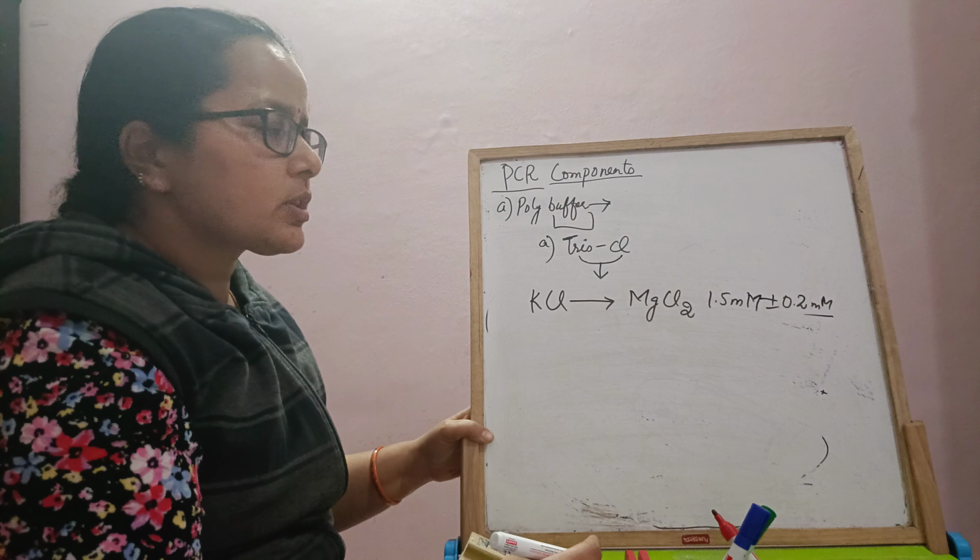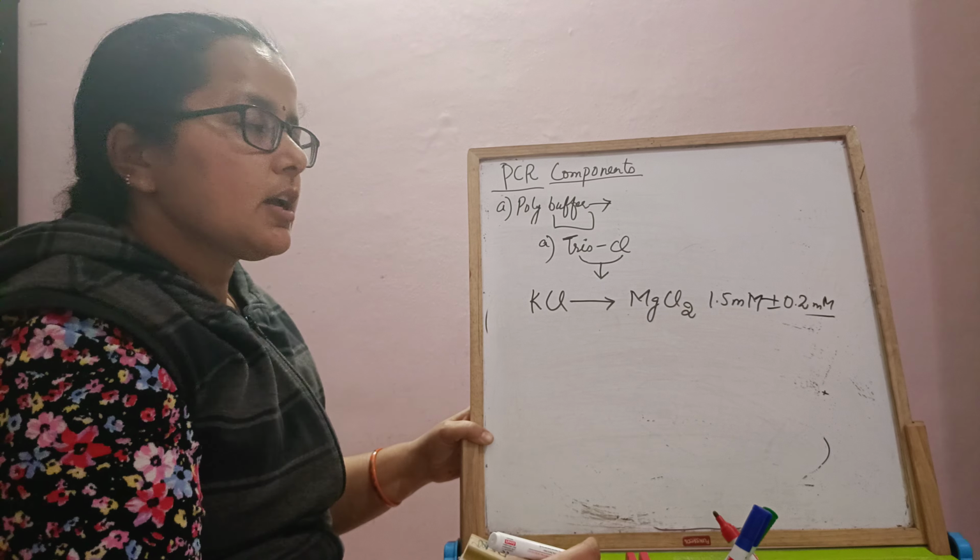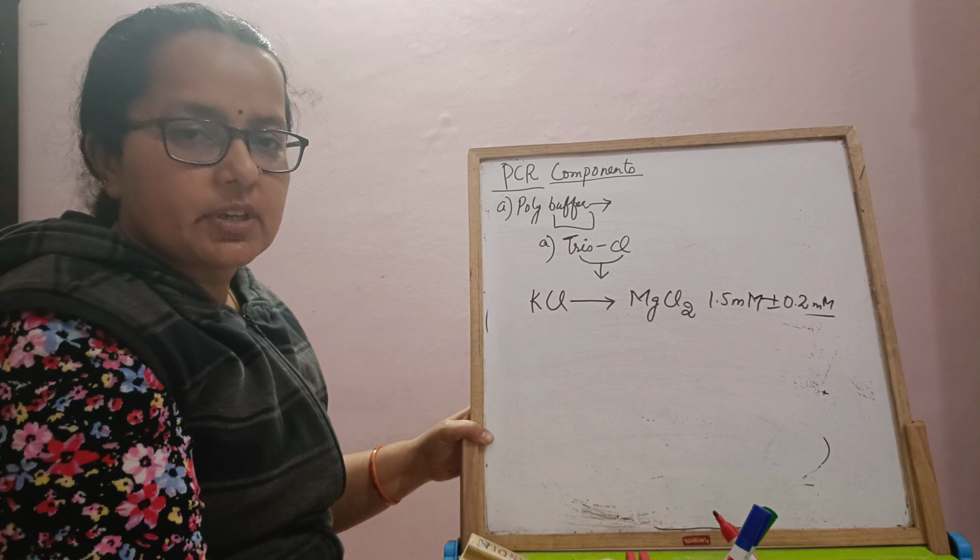But it should not be more than 1.5 millimolar, otherwise you will get non-specific amplification.